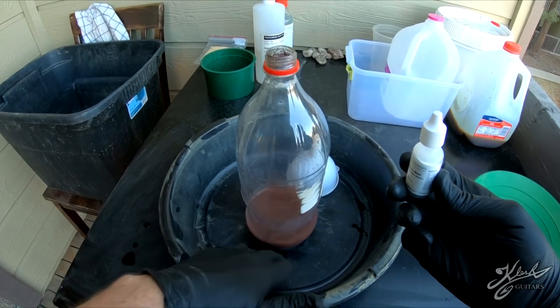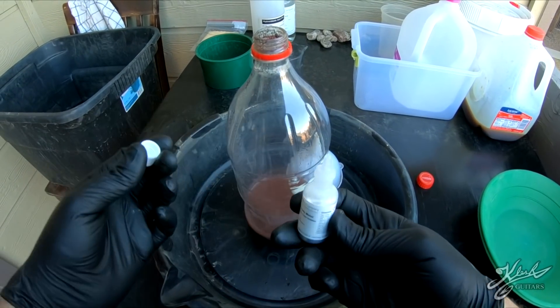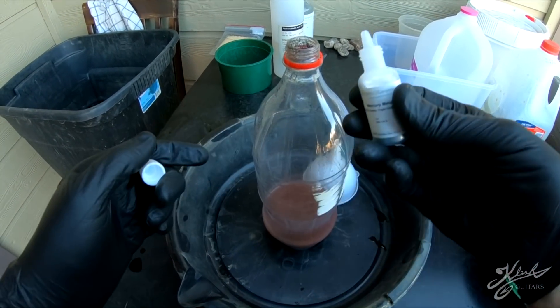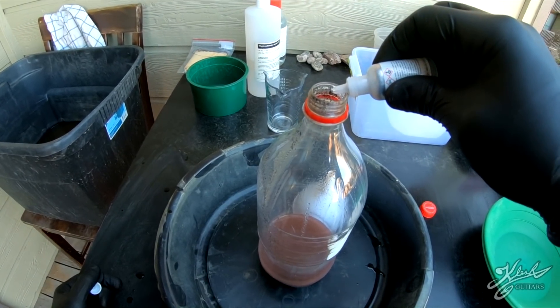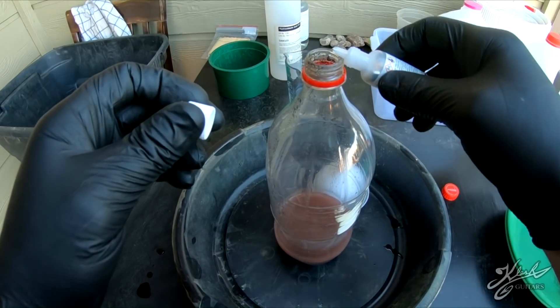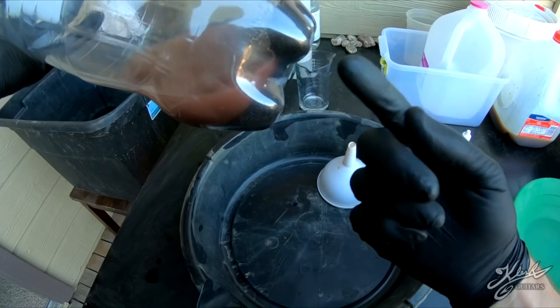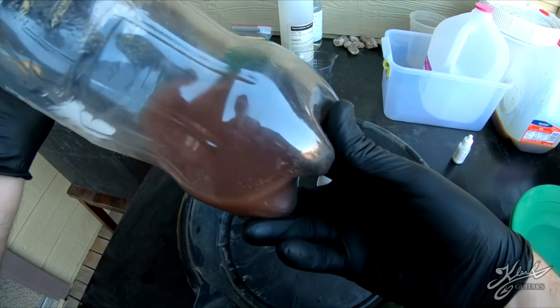Now we're going to add a little bit of mercury metal directly to this. Whenever you're working with mercury metal, make sure you're working over some type of plastic container - you don't want this stuff to hit the ground. We're just going to add a little bit in here - just a few drops. We're going to shake it up; the mercury is going to contact all the gold and it's going to suck it up.